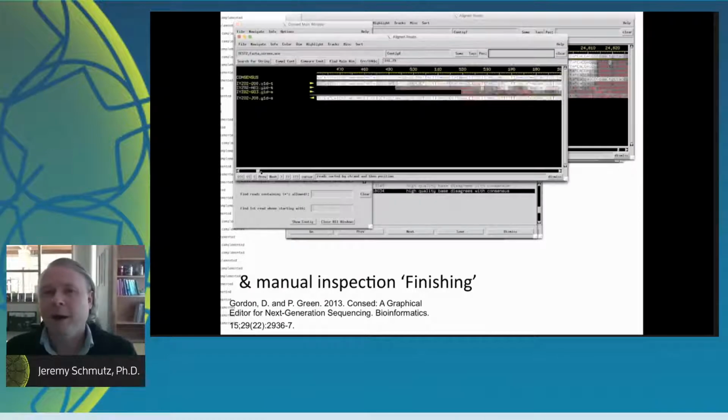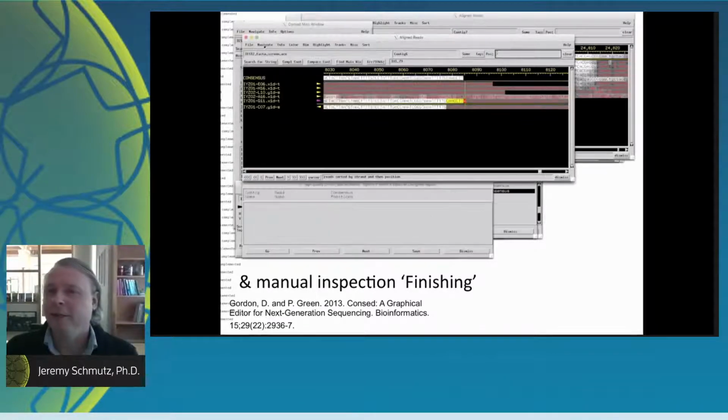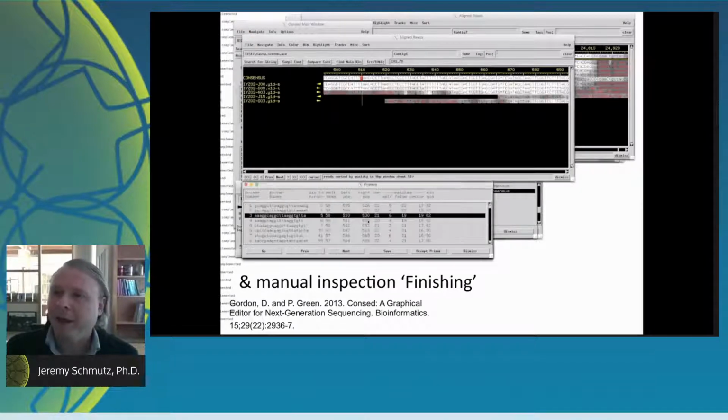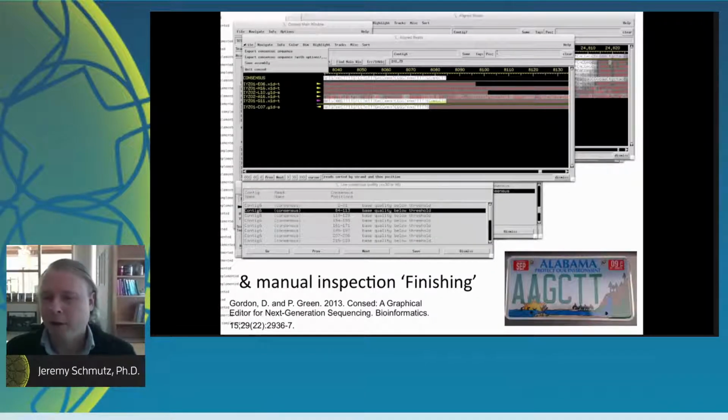There's a great part right here where I type in the end cut site here. It's a HindIII cut site. And we did that on thousands of clones over the Human Genome Project also. So this is what it was like really to sequence a genome. And some people didn't get to experience that. Now you've had almost a whole minute of it. I typed in the dang HindIII so many times that we just put it on our license plate because it was easier to remember. It's like muscle memory now.